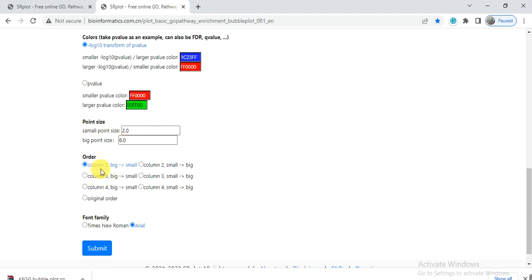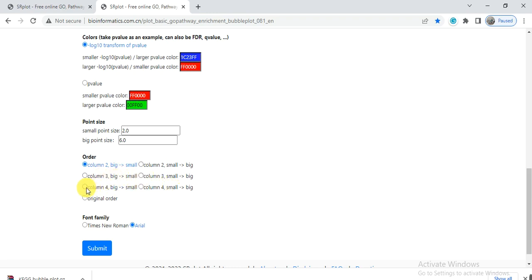Then there's the order - in which order will column 4 come: big to small or small to big - you can choose it. Here is the font - you can choose it. Then click on submit.